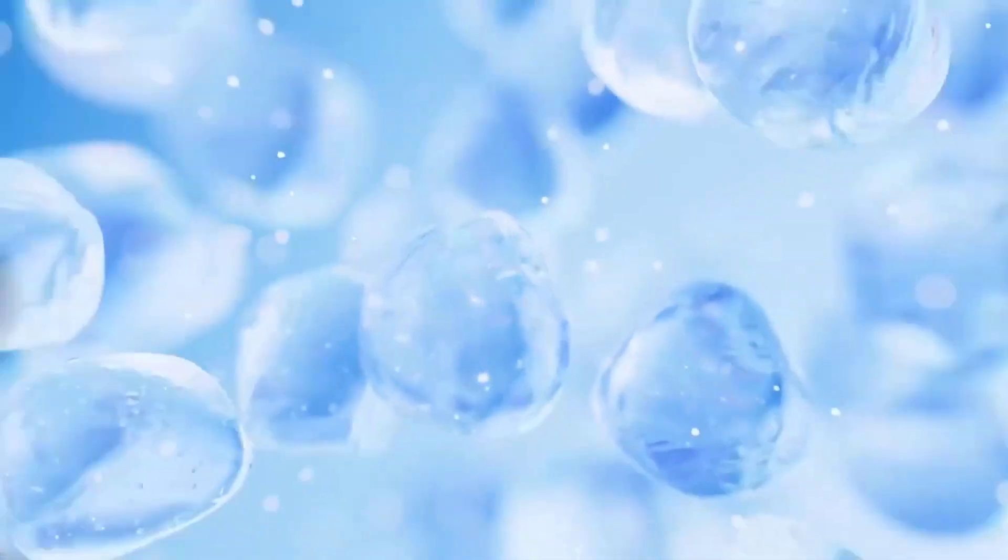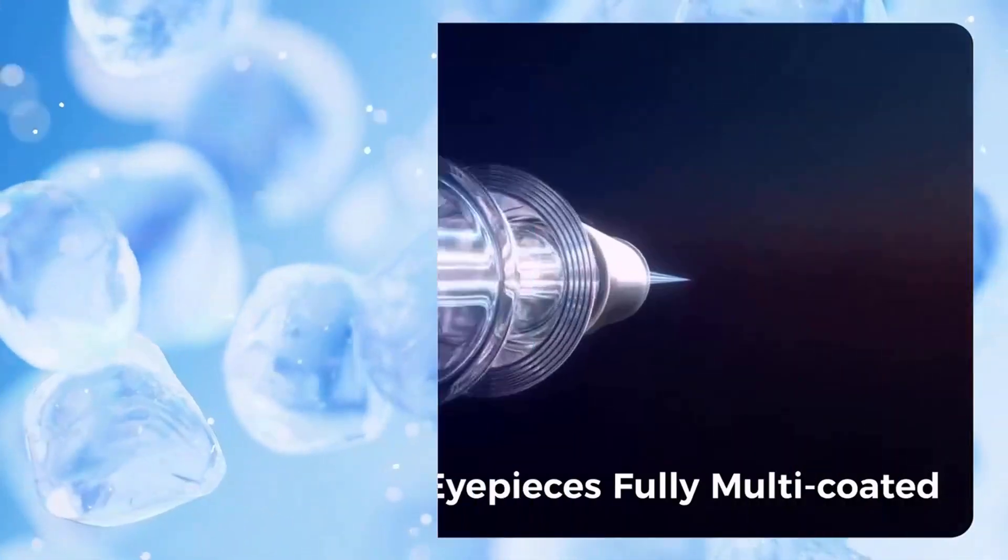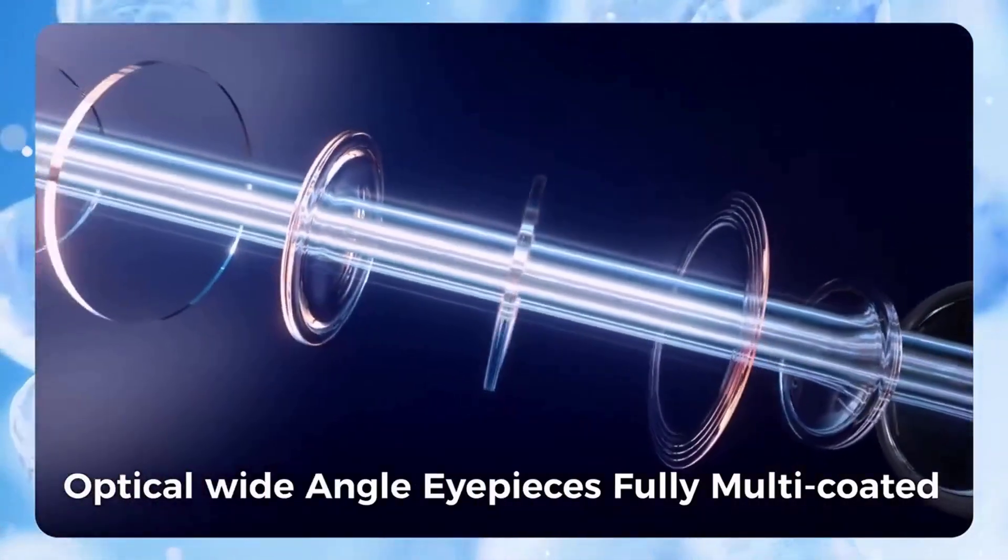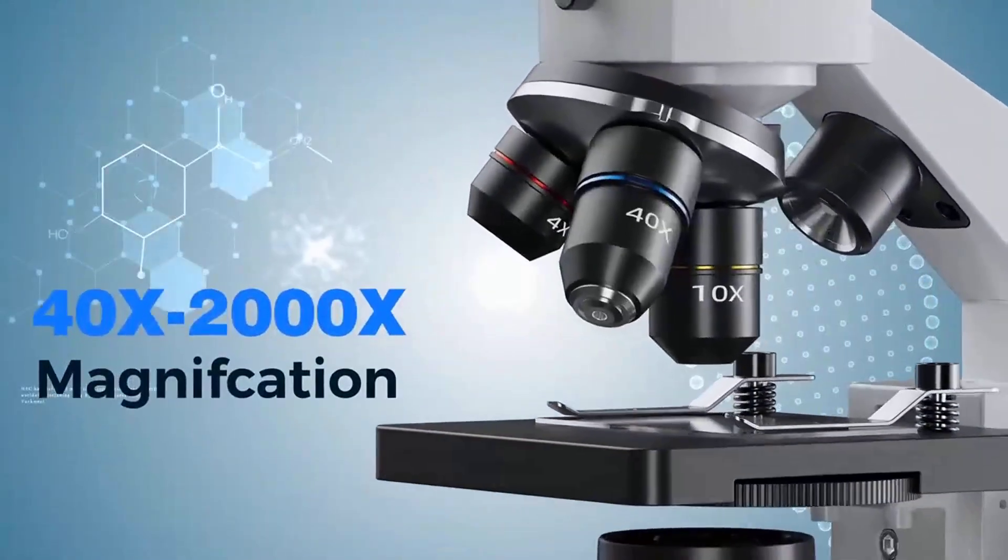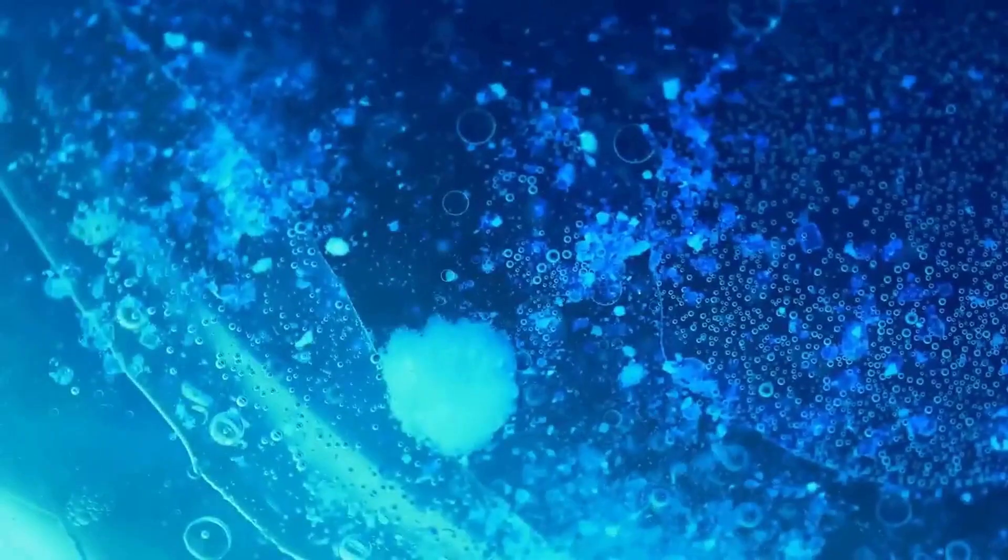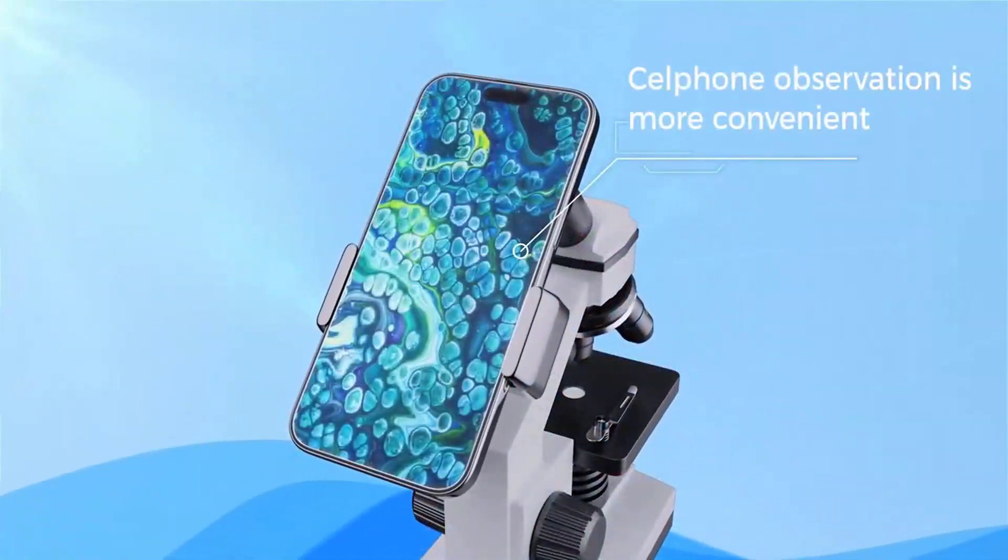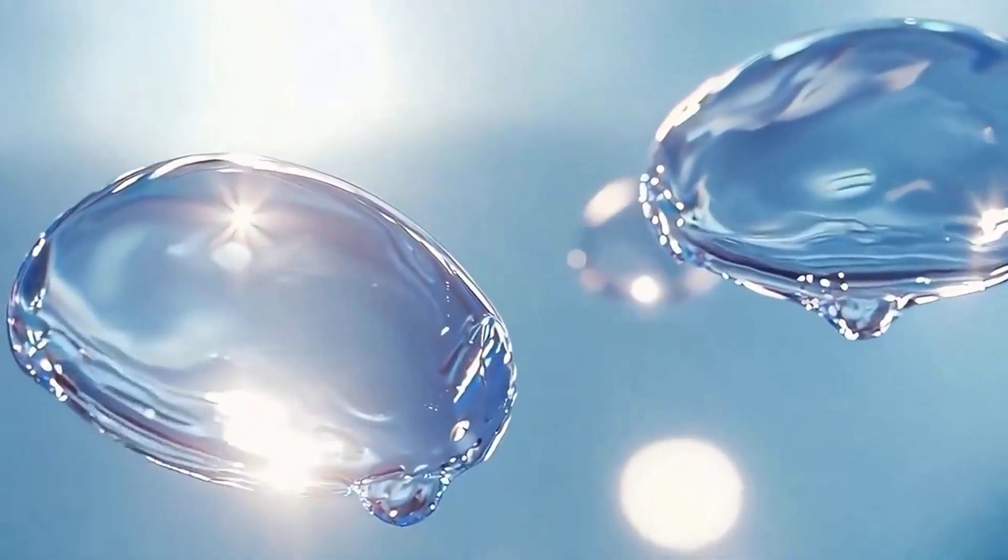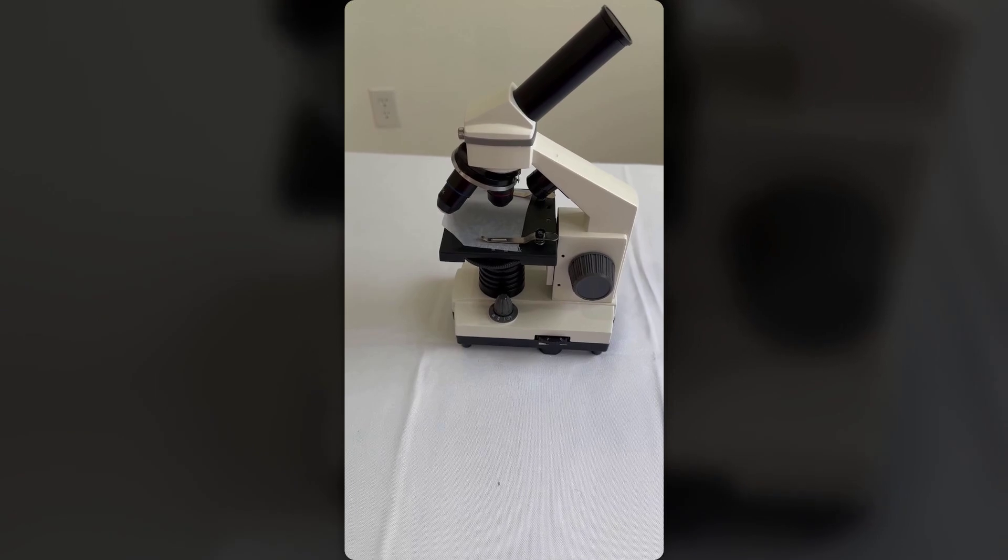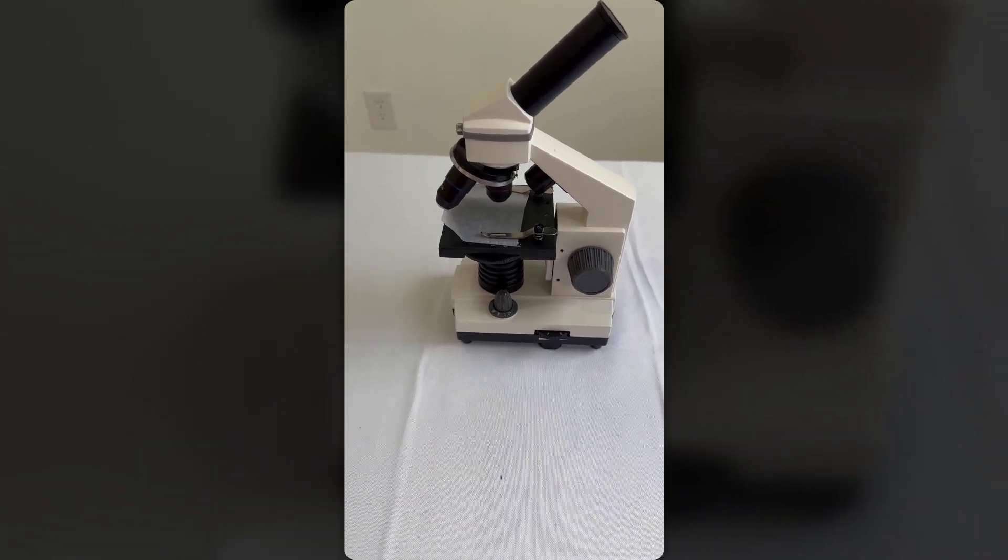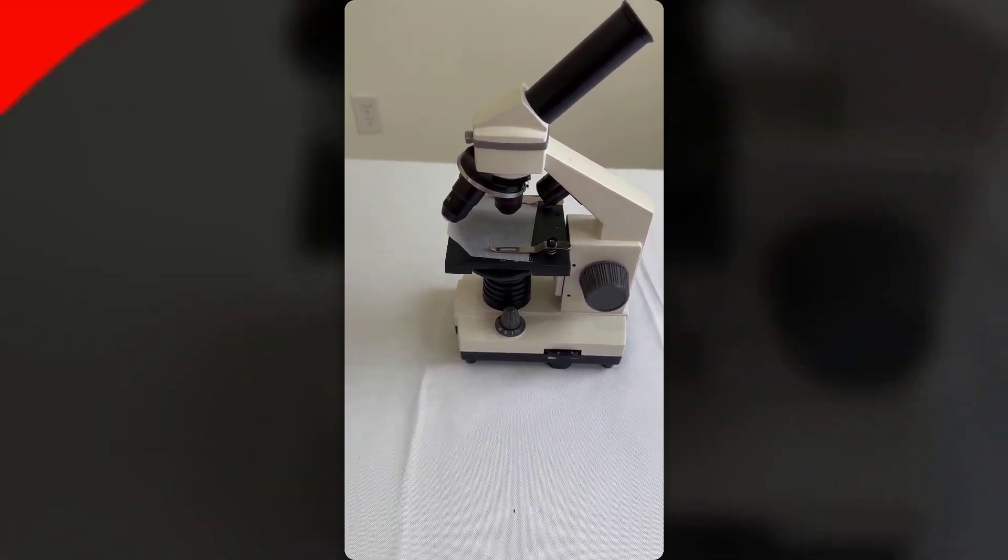In terms of value proposition, the Zovtron stands out in its price category. While not designed for professional laboratory use, it achieves an ideal balance between performance and affordability, making it perfect for home education and discovery. The addition of the Bluetooth shutter technology gives it a distinct advantage for those focused on documentation. It represents an excellent entry point for beginners and serves as an ideal tool for educational projects and scientific exploration.